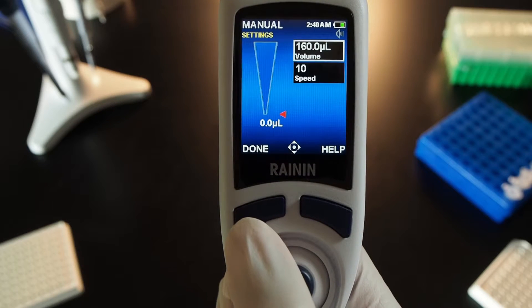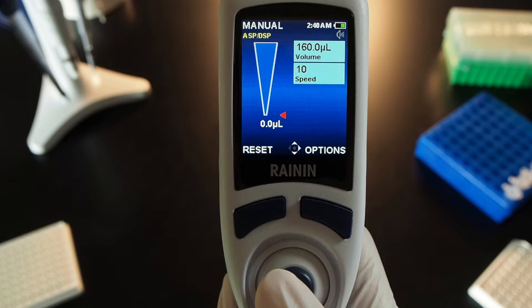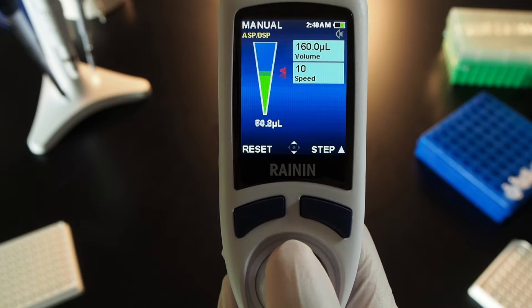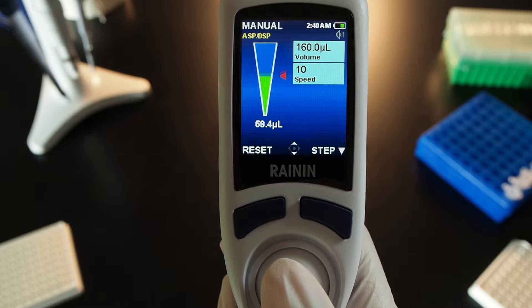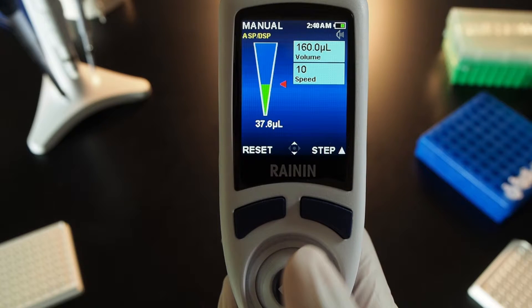Press done to set, and press done again to run the volume. Push and hold the joystick up to fully aspirate, then hold down to dispense completely. To aspirate or dispense in micro steps, aspirate a volume and stop.